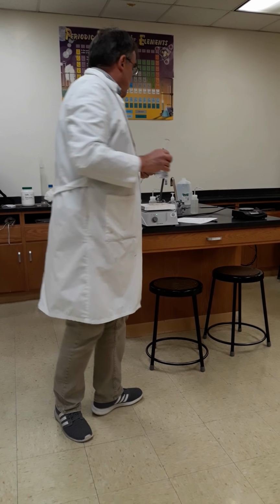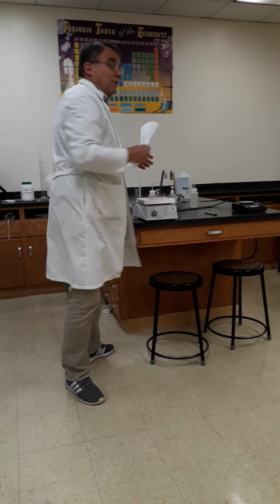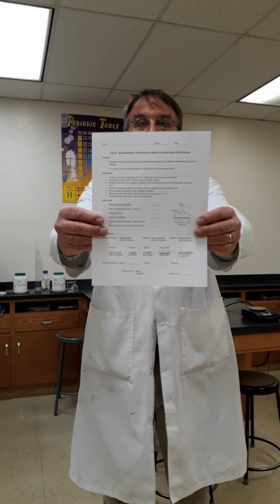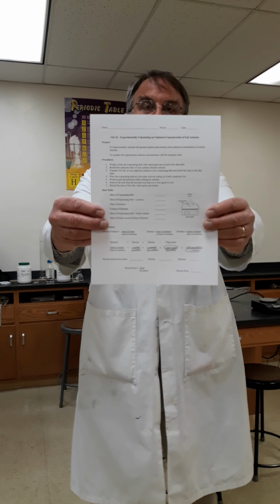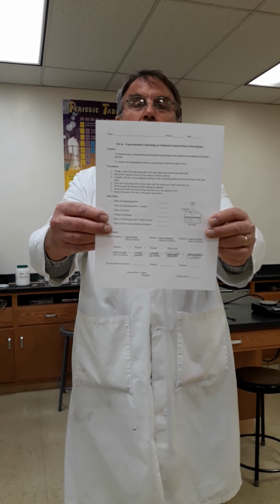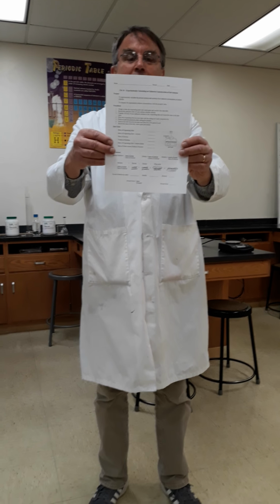Okay, so if you obtain the lab either from Google Classroom or my website, this is the lab you should have. Ideally, in a perfect world, in a non-COVID world, we would all be doing different solutions of different concentrations, but I don't have that much time, so we will all be doing solution A.